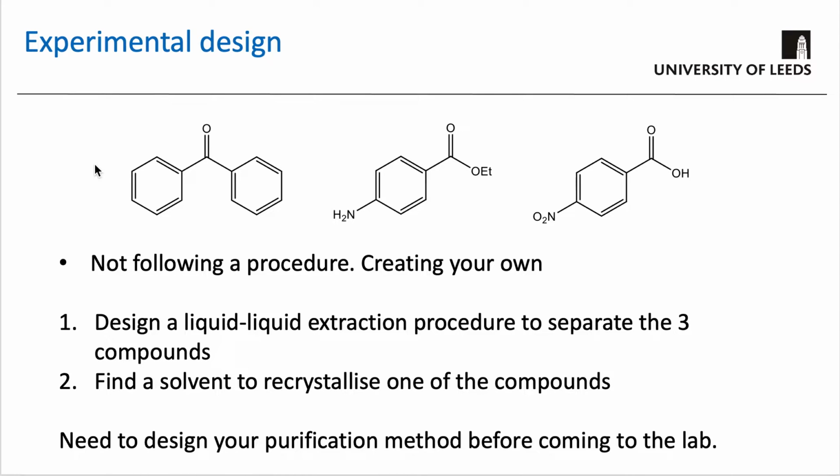Okay, so this is the key theory video for the experimental design experiment, which will help you design your own purification, so you can actually separate these three compounds using liquid-liquid extraction. You've got to apply this knowledge to design your purification.